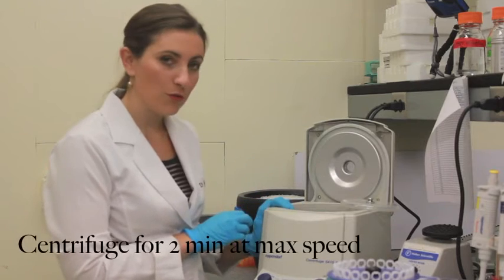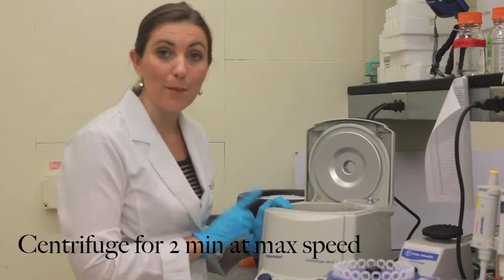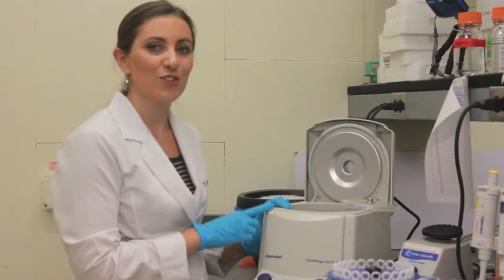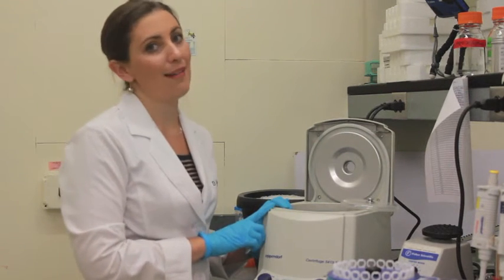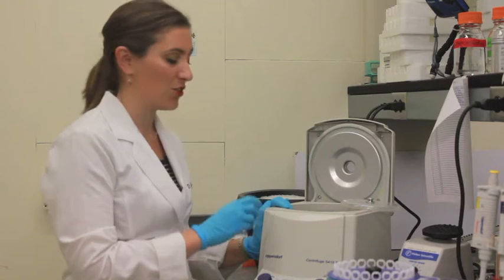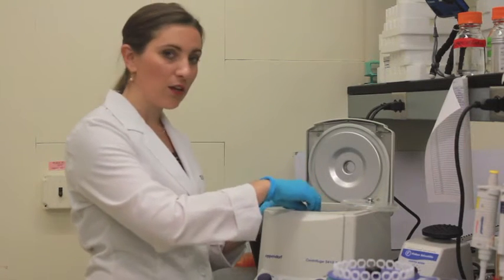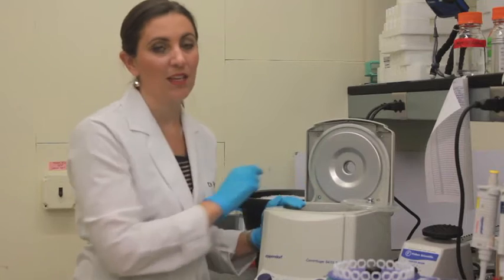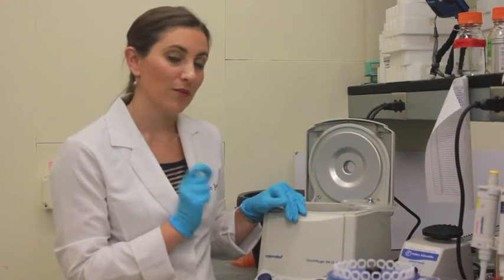When we go to put it into the centrifuge, we are going to run it for 2 minutes at maximum speed. Before you hit start, make sure that the microcentrifuge is balanced — we don't want to break the machine. For every sample that goes in, there should be another tube exactly opposite. The point of this step is to pellet, or bring all of the bacteria and debris in our sample down to the bottom of the tube.